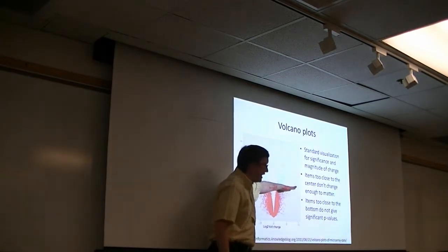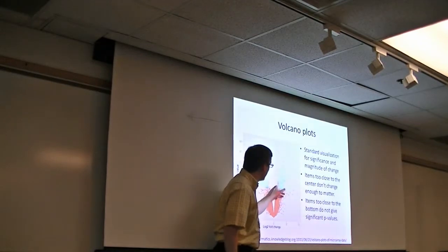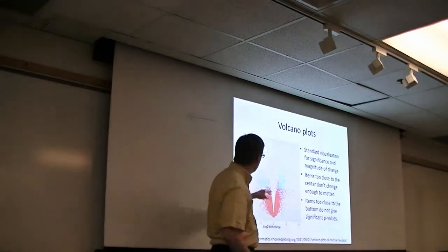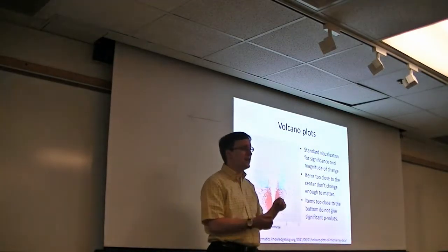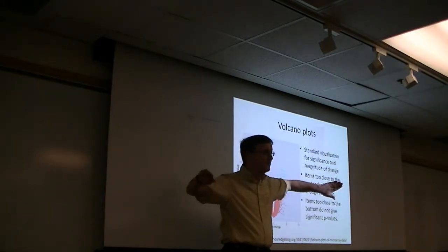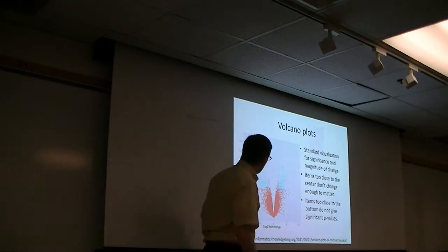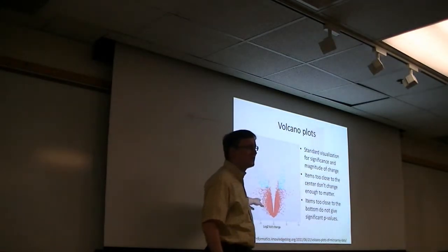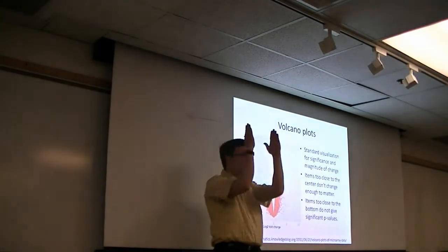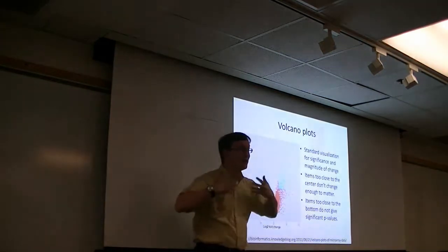Next, we have another line that we've thrown in here, and anything above it and outside the middle is going to be colored blue. So in this case, the blue sector here is to show things that have a fold change that's big enough to be meaningful, meaning they're far away from the middle, and they're high enough to be significant. So whenever you're reading these plots, it's always worthwhile to keep in mind those two lanes. You're looking for things that are outside the middle and things that are high enough to be called significant.